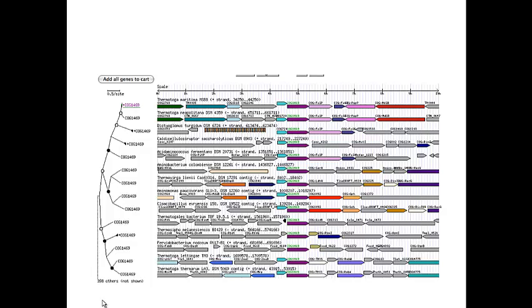Remember, in SEED, you have their clustering tool, and on any annotation page, you have your genome compare genome view. This is pretty much the same view in microbes online. It'll give you the compare view here, okay? So here is this COG 1469, and what you see is the pink one is a FolP gene. So it's clustered with a FolP gene in a few genomes.